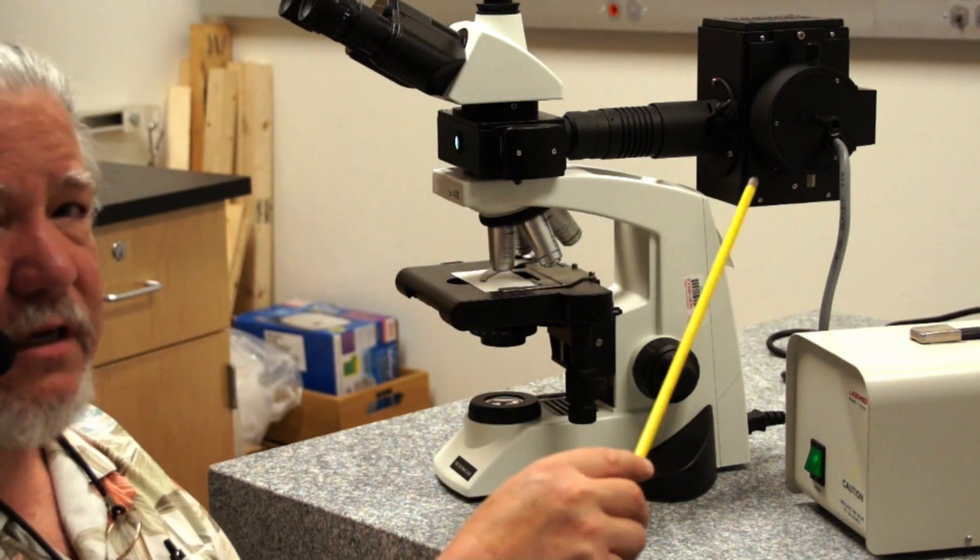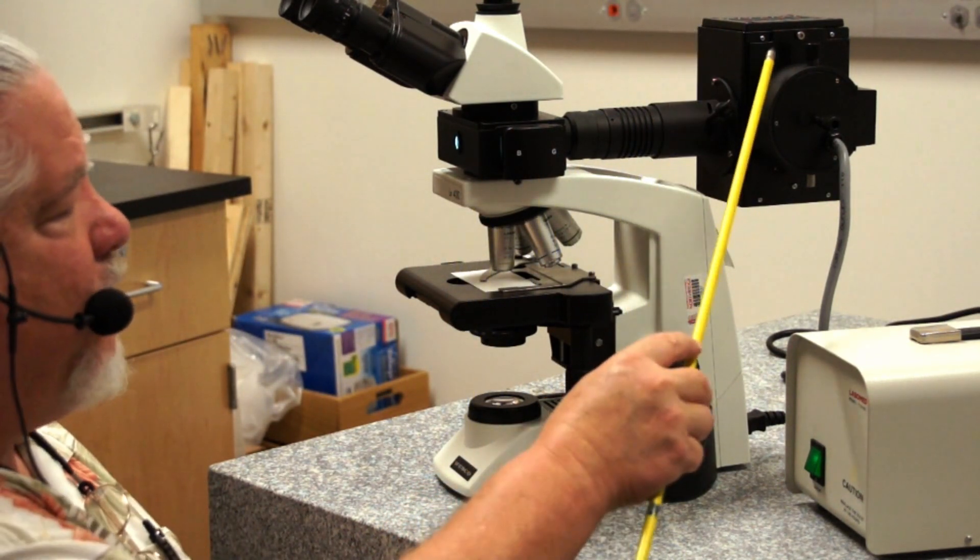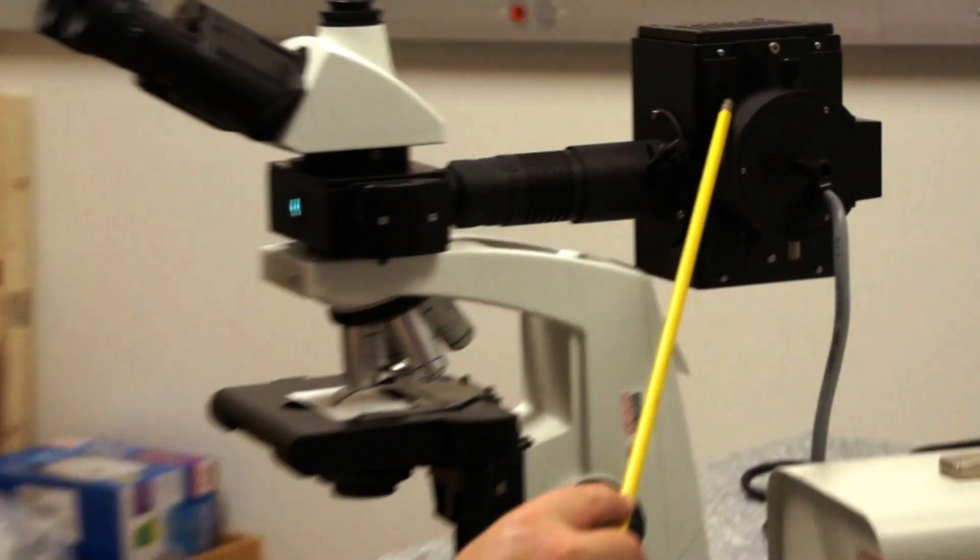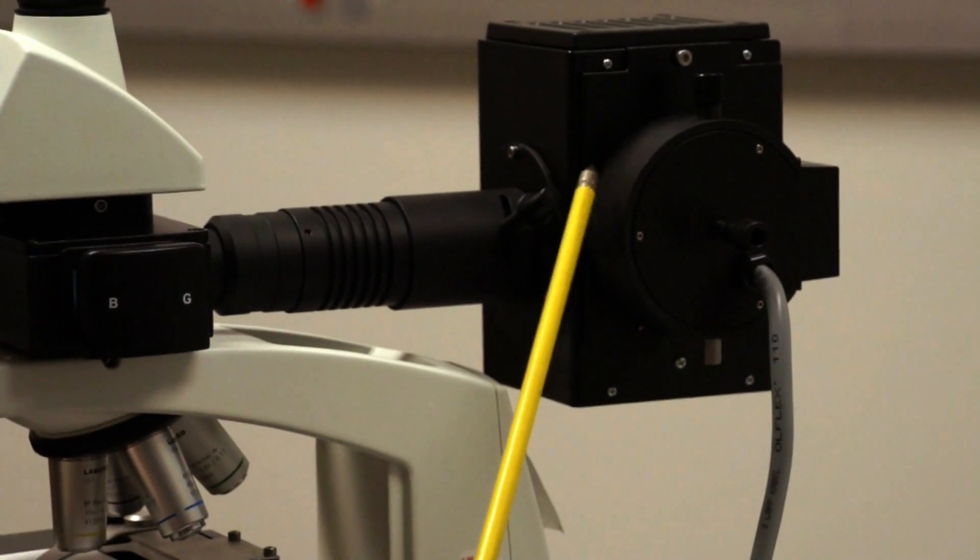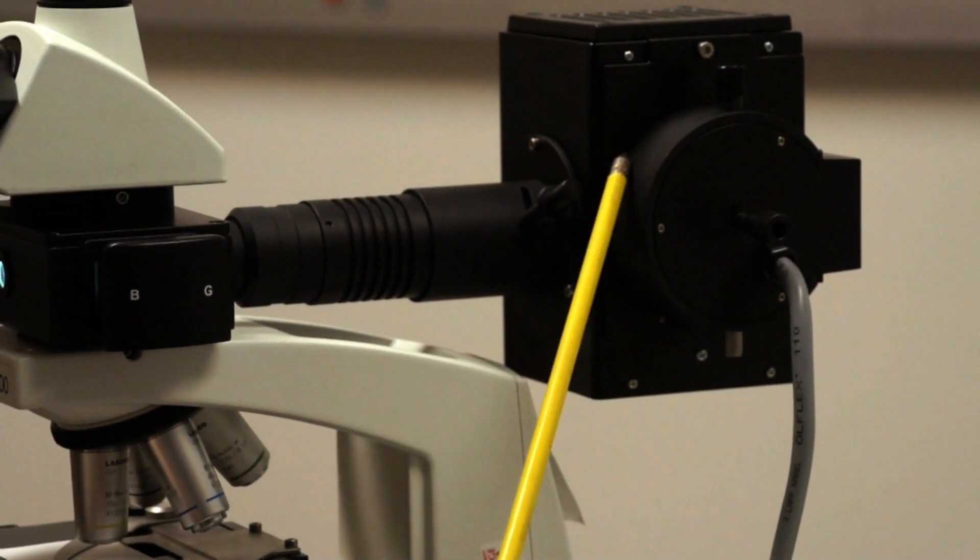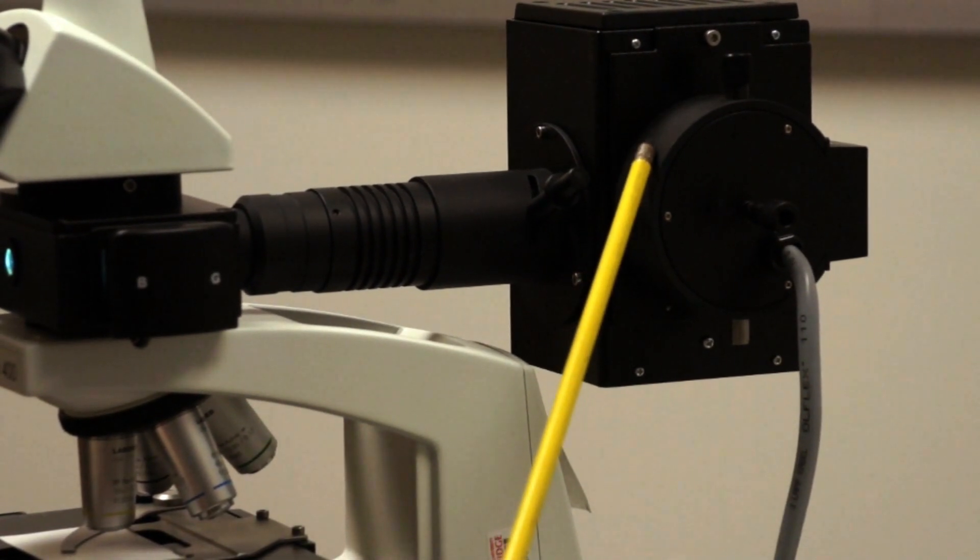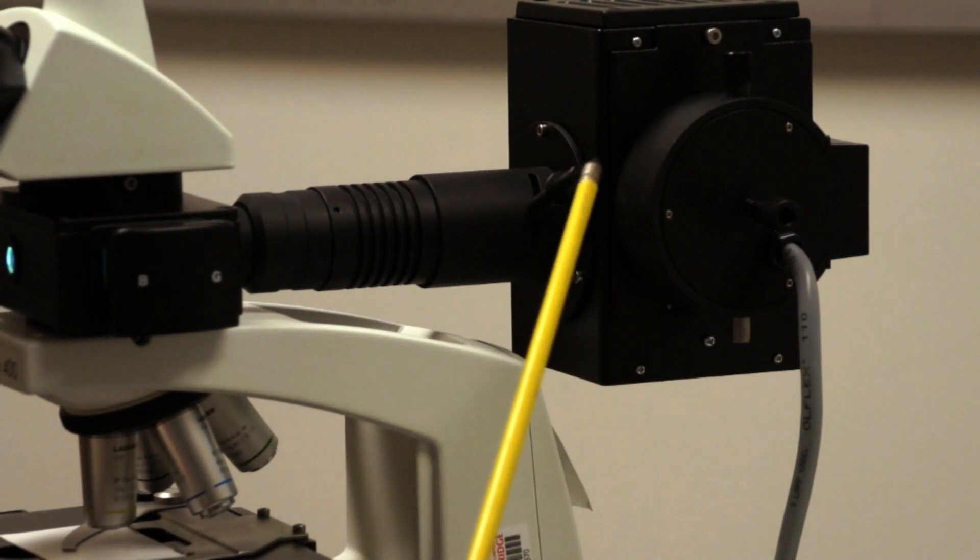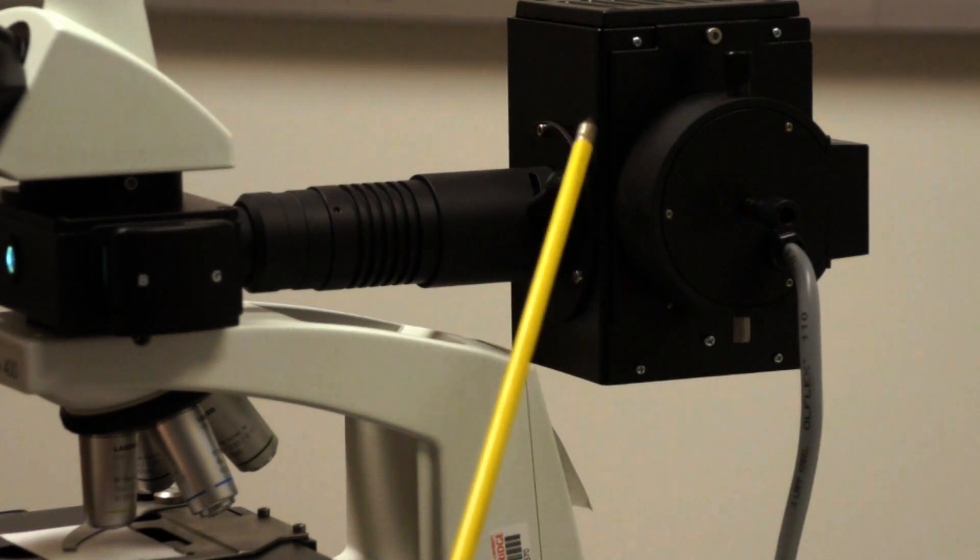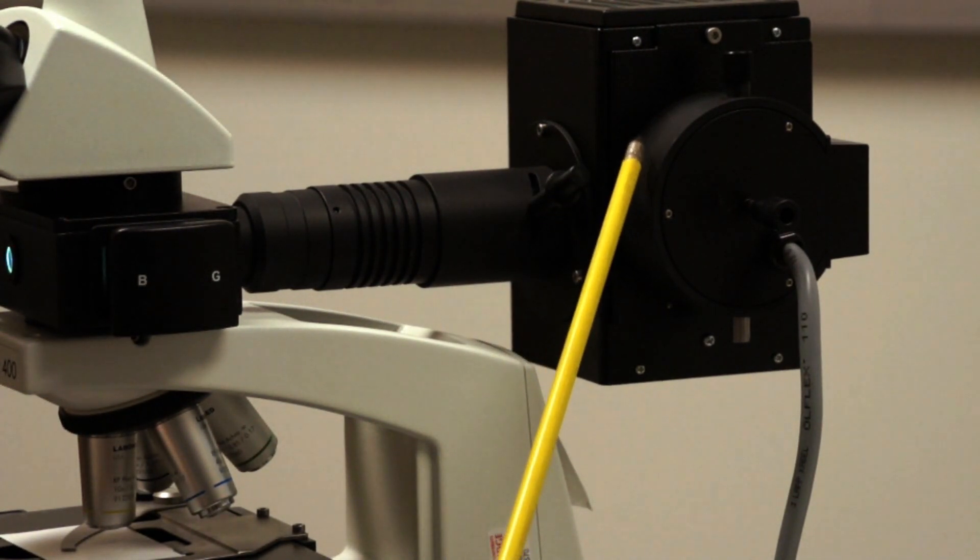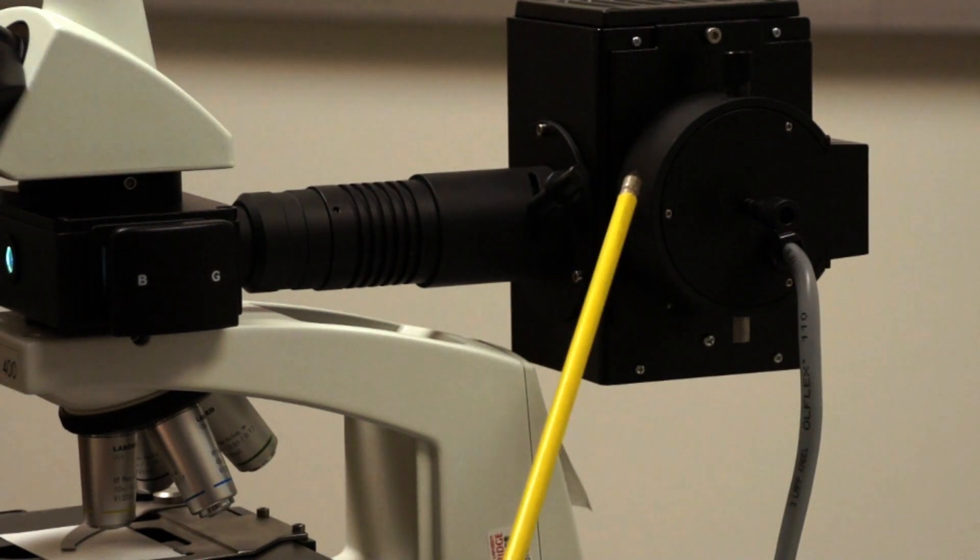So let's discuss the components of the reflected light illuminator. Here we have a large lamp housing which holds a bulb that burns very brightly. Typically these are called mercury vapor pressure bulbs. These are high pressure bulbs that must be handled very carefully because they can explode and destroy your lamp house. And this puts out a tremendous amount of illumination.